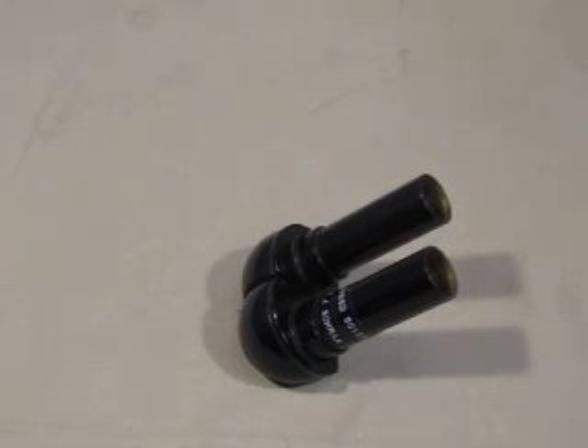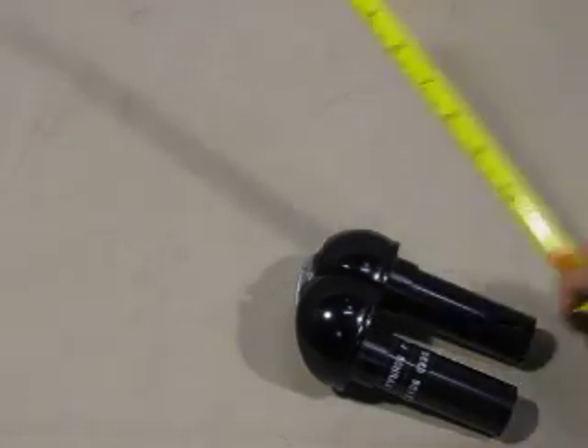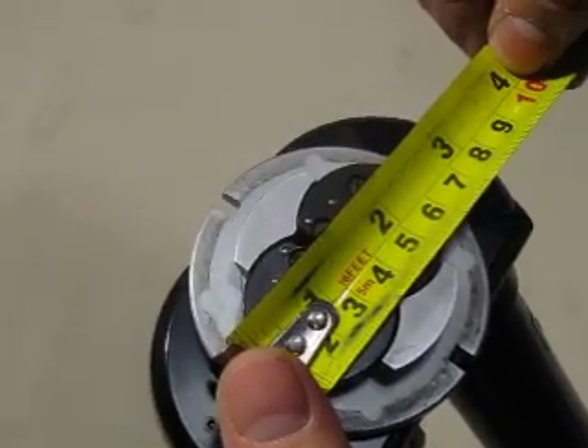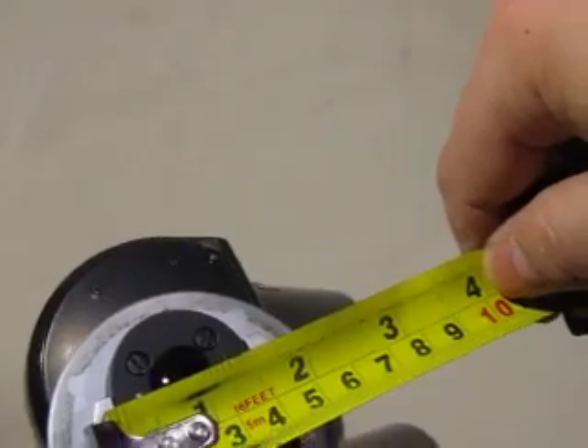Up for auction, we have one black binocular microscope head. It's four inches long for the eyepieces and approximately four and a half inches wide. The bottom plate is two and three quarters inches. The inner plate is just under two inches.